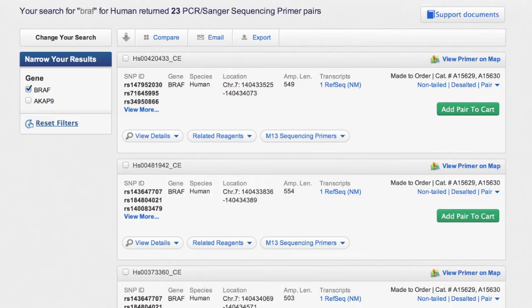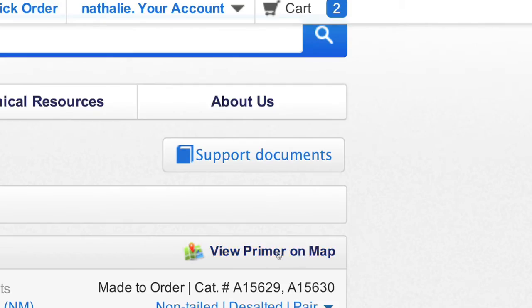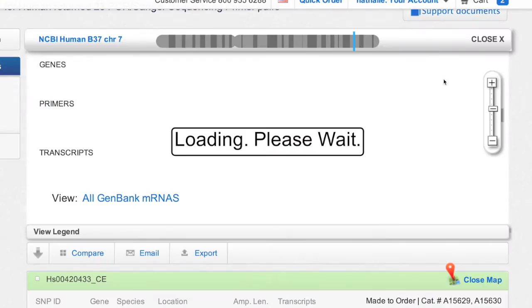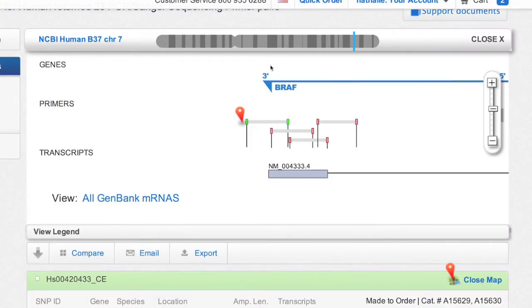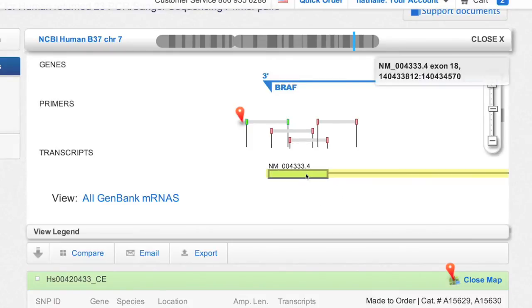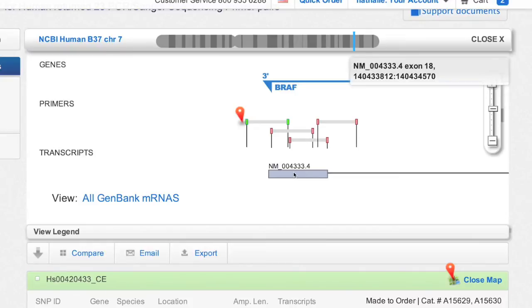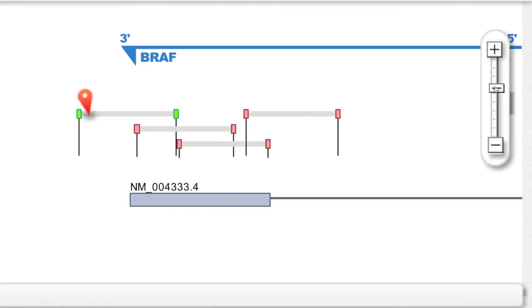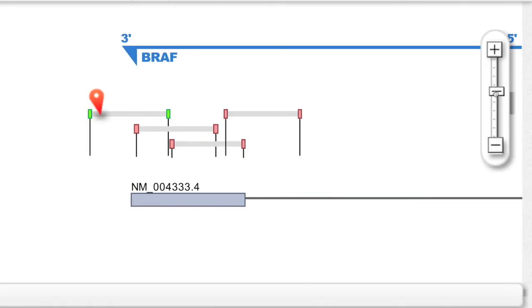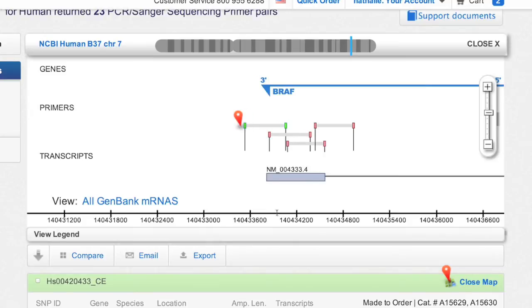If multiple primer pairs are shown for your target, you can easily visualize them on a handy map. Here you see the chromosome with the BRAF gene region in blue, the graphic representation of the gene, the different primer pairs available for this region of the gene, and the transcript of the gene with each exon represented by a rectangle. Place your cursor on the rectangle to see the exon number. You can zoom in and zoom out, and use the slider to explore other parts of the gene.